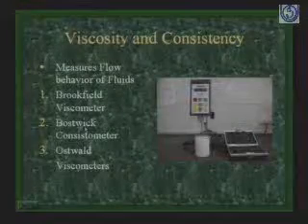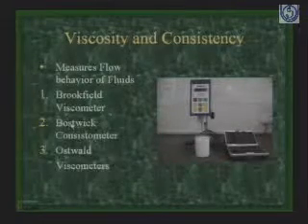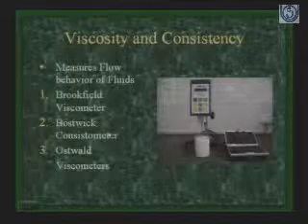So one layer tries to flow upward, and another layer, because of gravity, puts pressure downward. So it resists the flow of the product. How much this product will flow on this consistometer can be determined, and this can be determined as per the international standard within 30 seconds.